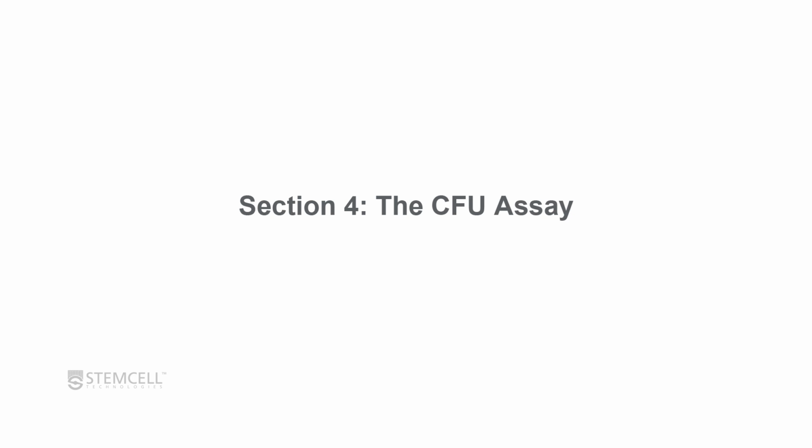So you've heard a lot now about the CFU assay. I'm going to dive in a little bit now and talk more specifically about the CFU assay and describe some publications that show the usefulness of this assay, especially when it comes to looking at potency and stability.